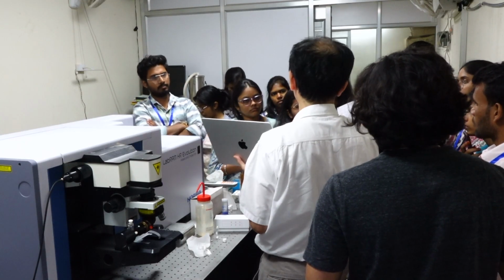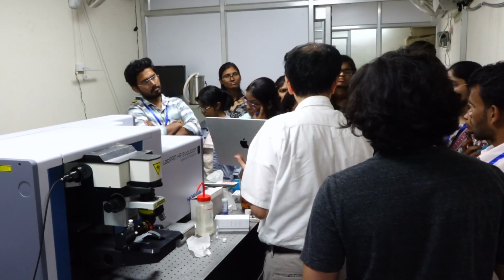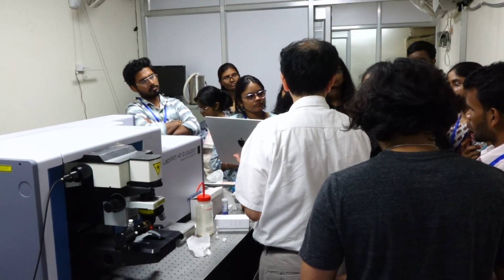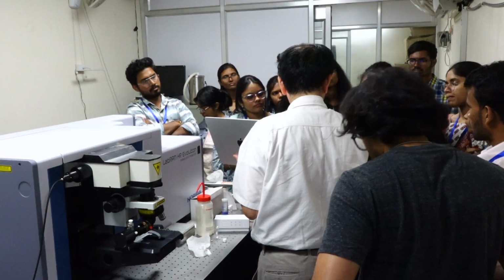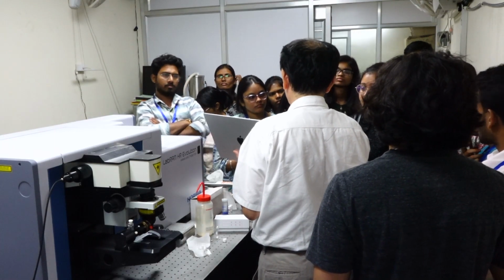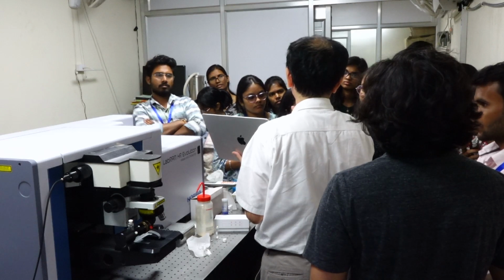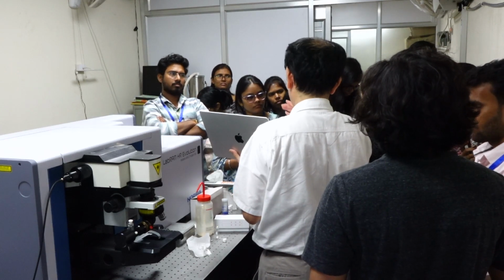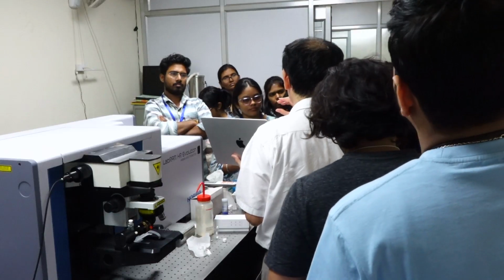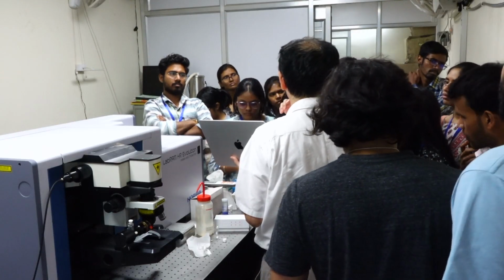It does depend on the sample as well; these two parameters will also be affected by the type of sample. In the case where photo damage is significant, we need to decrease the exposure time and the total acquisition time.